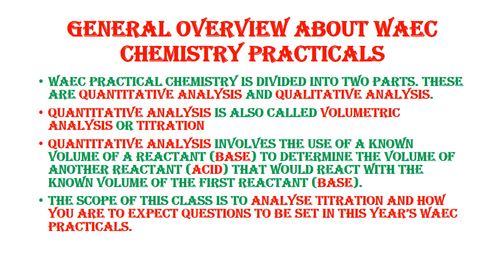So in quantitative analysis or volumetric analysis, it involves the use of a known volume of a reactant to determine the volume of another reactant that would react with the known volume of the first reactant, which is the base. So the scope of this class is to analyze titration and how you are to expect questions to be set in this year's Waec practicals. We want to analyze titration, how you expect it, as well as manipulations to get nice readings for your calculations.